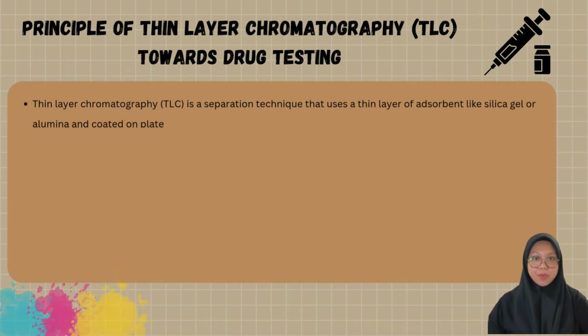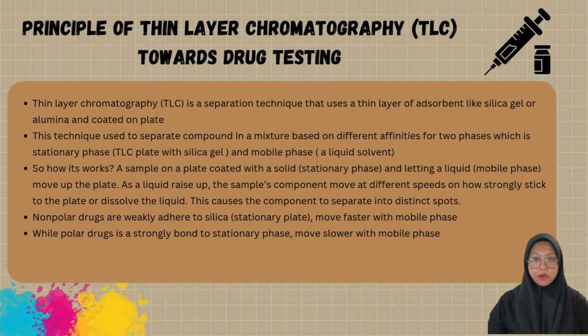Let's talk about the principle of thin layer chromatography, or TLC, toward drug testing. TLC is a separation technique that uses a thin layer of adsorbent like silica gel or alumina coated on a plate. This technique is used to separate compounds in a mixture based on their different affinities for two phases, which are a stationary phase, the TLC plate with silica gel, and a mobile phase, which is a liquid solvent.